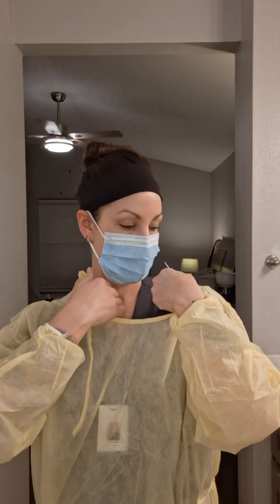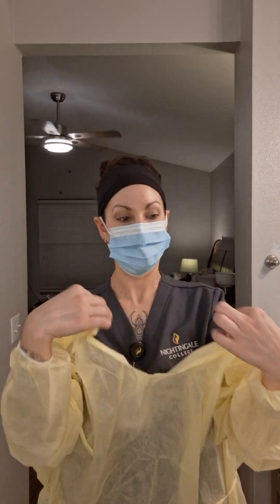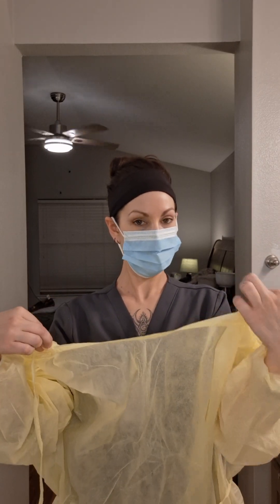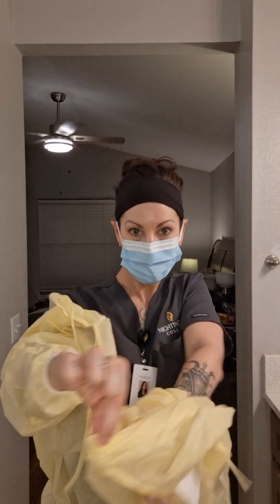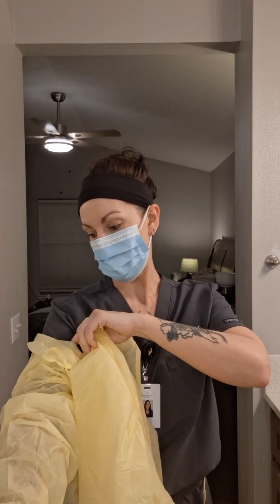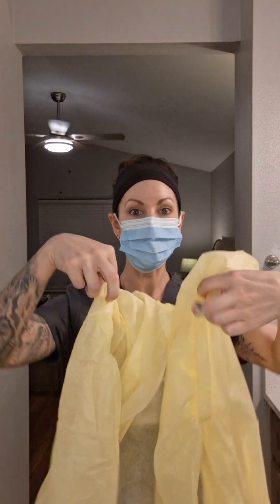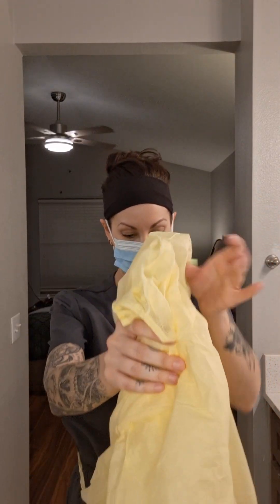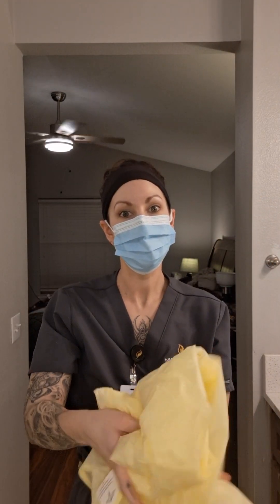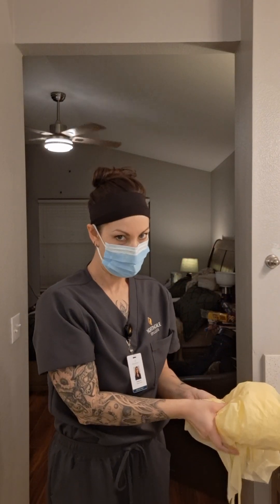Now I'm going to come from the inside of the gown and pinch from the inside. Remove — one hand through, grab it from the inside, remove one arm through. Take it and fold it outside in, crumple it up, and discard in the appropriate receptacle.